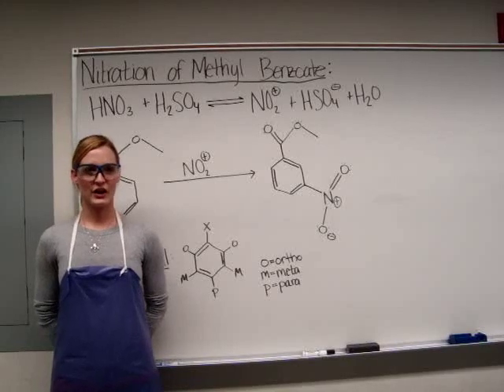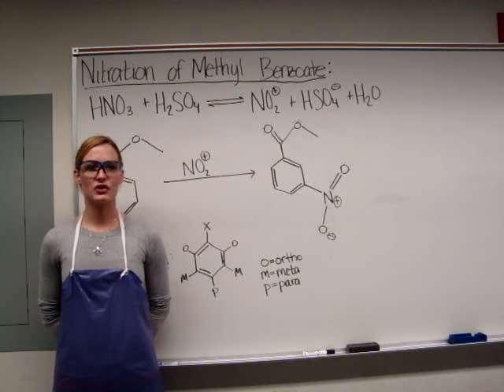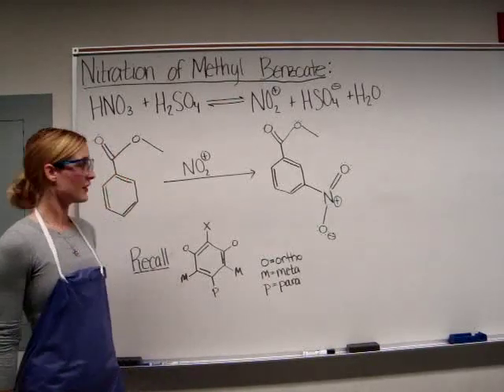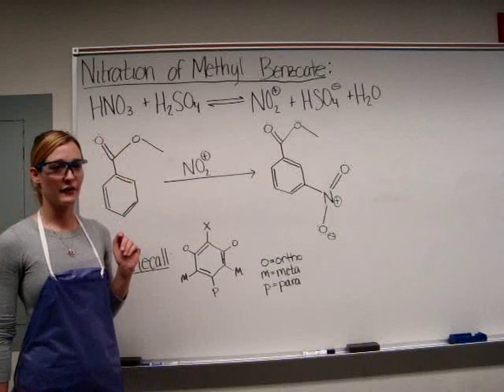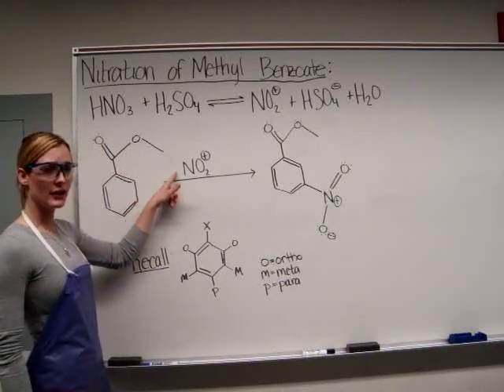We'll be doing a nitration of methyl benzoate. Methyl benzoate is an aromatic compound structurally related to benzene. The aromatic ring is electron-rich and will react with electrophiles. The electrophile used in this reaction is a nitronium ion.